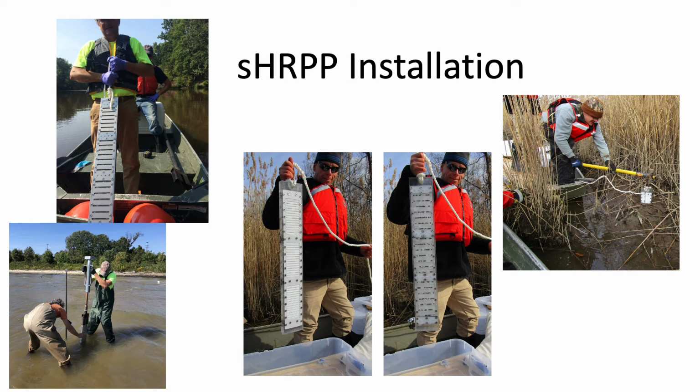The next part of this presentation covers the installation of the samplers once assembled. And as mentioned, the samplers are generally driven in by hand. They can be driven in by hammer, shown here. They can be driven in with a fence post driver. In some cases, they can just be pushed in if the sediment is soft enough.